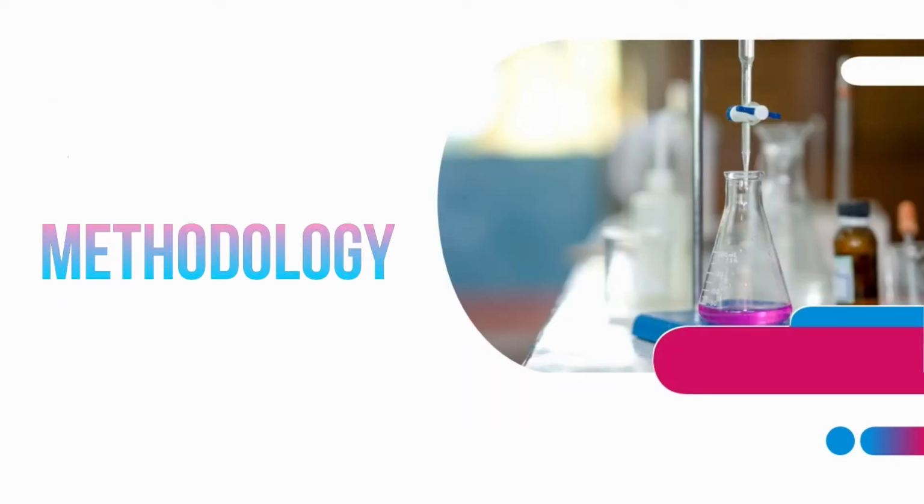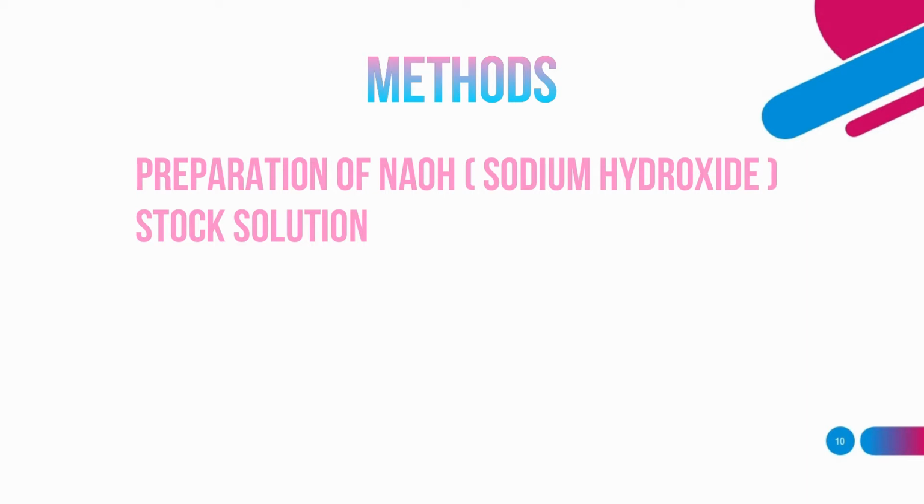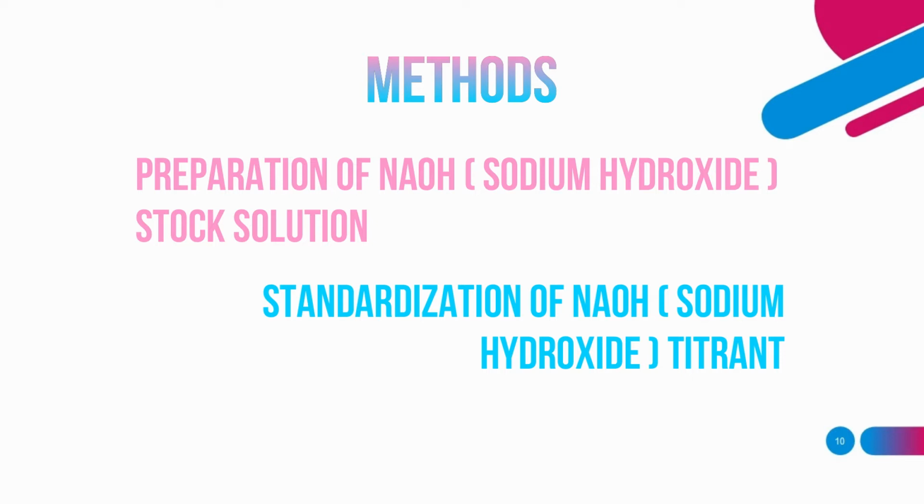For the methodology, it is separated into three parts. First, the preparation of NaOH stock solution. Second, standardization of NaOH titrant. And third, the unknown analysis.